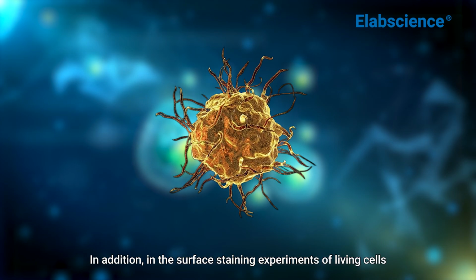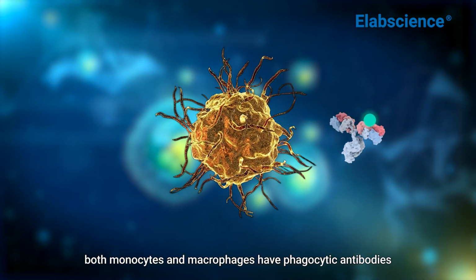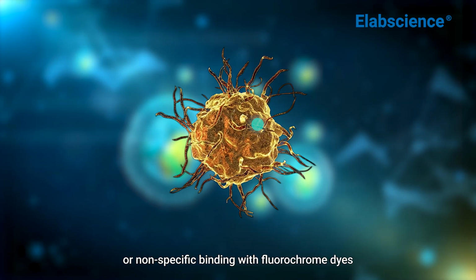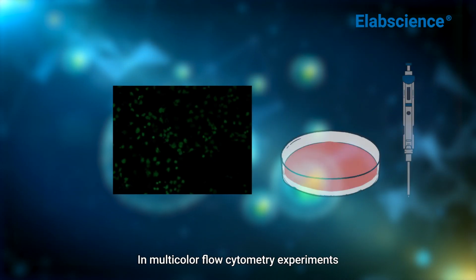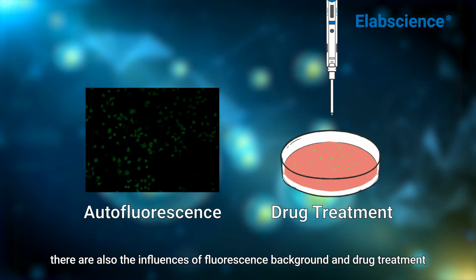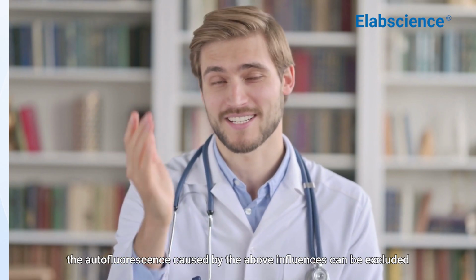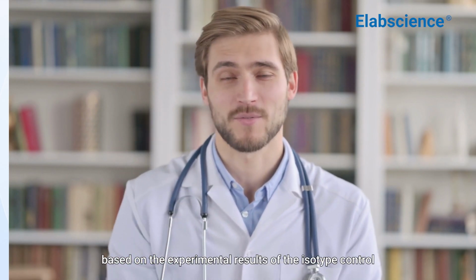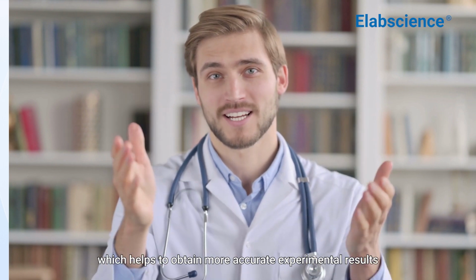In addition, in the surface staining experiments of living cells, both monocytes and macrophages have phagocytic antibodies or non-specific binding with fluorochrome dyes. In multicolor flow cytometry experiments, there are also the influences of fluorescence background and drug treatment. When these situations occur, the autofluorescence caused by the above influences can be excluded based on the experimental results of the isotype control, which helps to obtain more accurate experimental results.